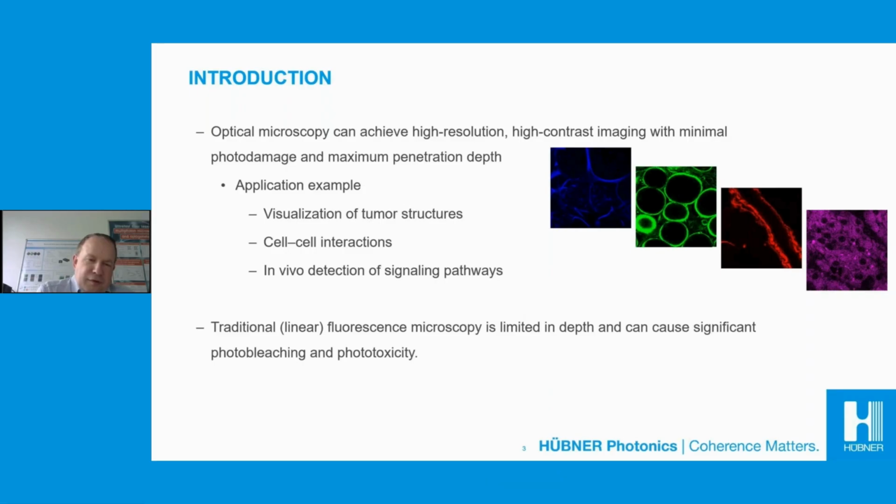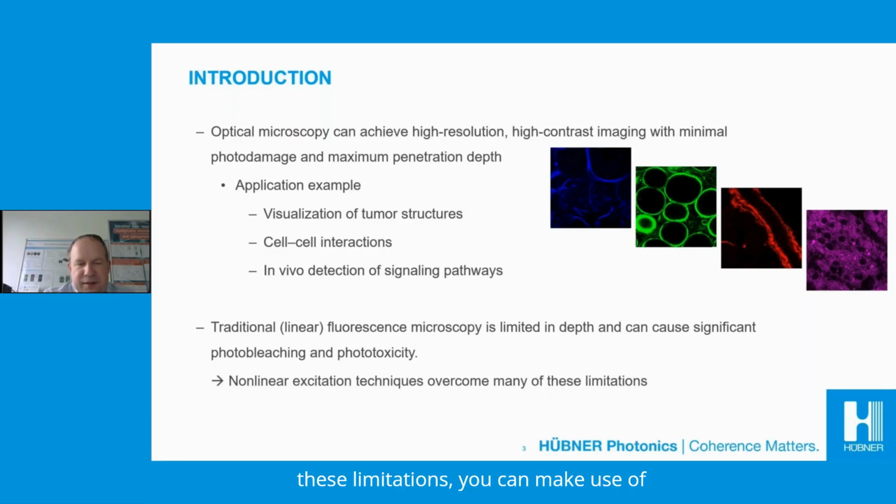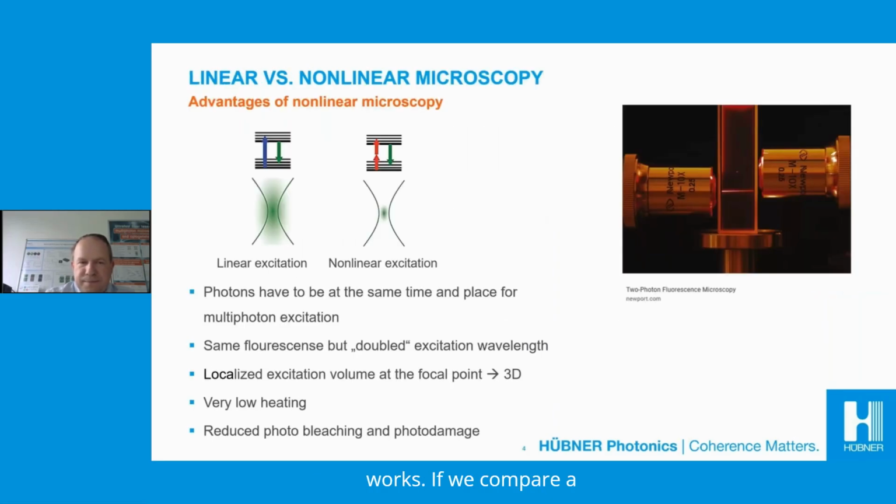If we talk about microscopy, there's so-called linear or fluorescence microscopy, which is limited in penetration depth, and it can also cause significant photobleaching and phototoxicity. To overcome these limitations, you can make use of so-called nonlinear excitation. And now I will just show you how it works.